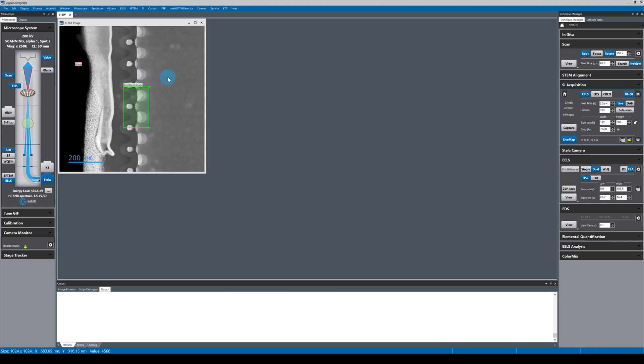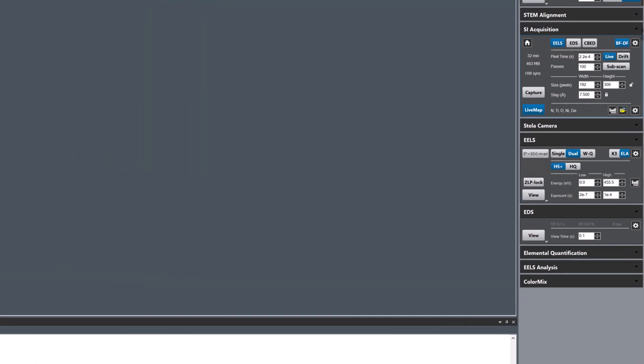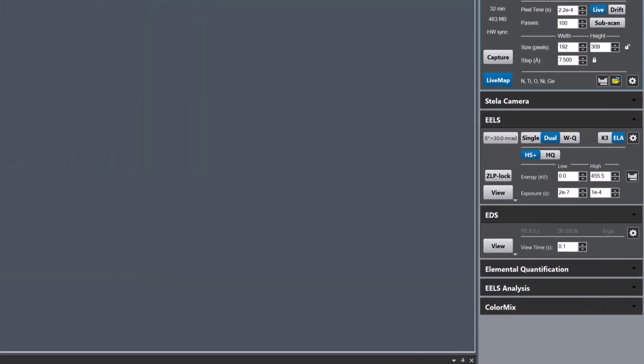In this video I'm going to be showing you how to use fast dual EELS for spectrum imaging in digital micrograph. It's very straightforward, just go to the EELS palette and select dual mode.